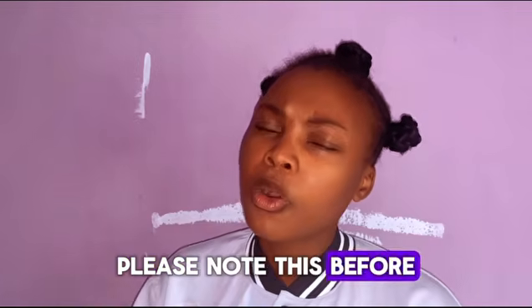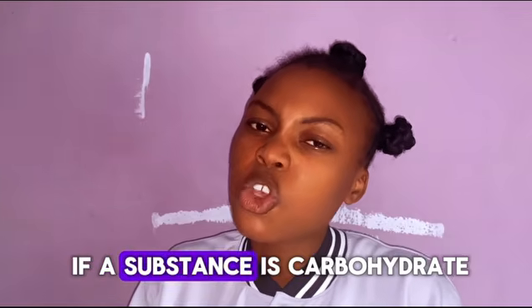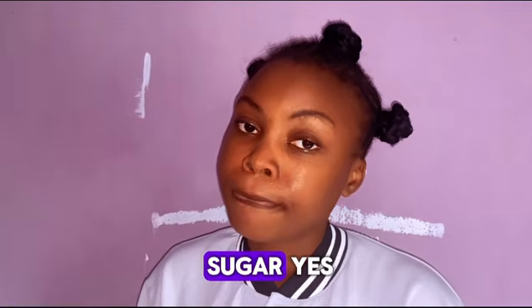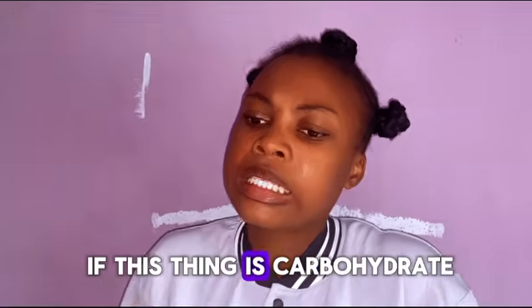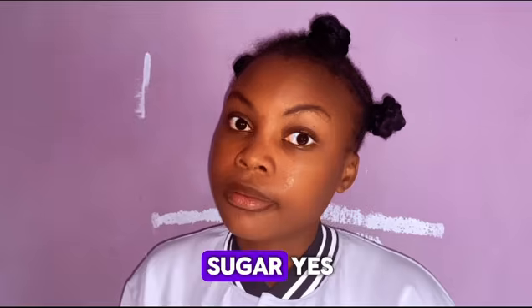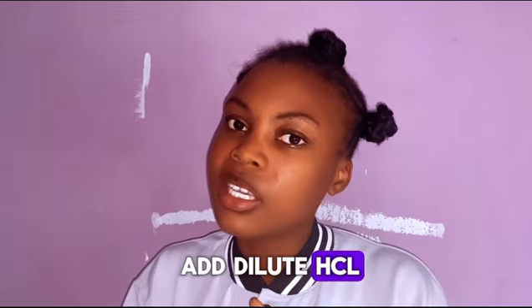Please note this before we end the class. The following test may be used to know if a substance is a carbohydrate or a non-reducing sugar. So how can you know if this thing is a carbohydrate and a non-reducing sugar? The first one is that you should add dilute HCl.